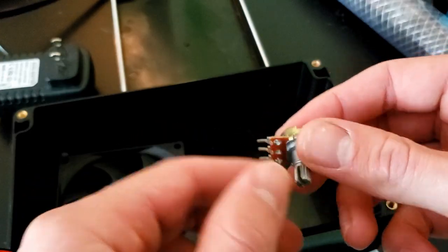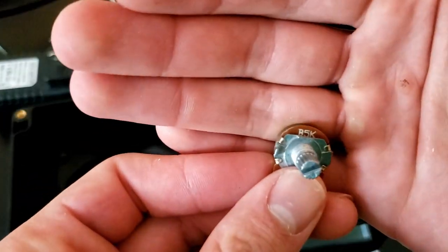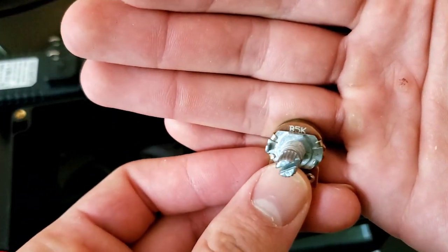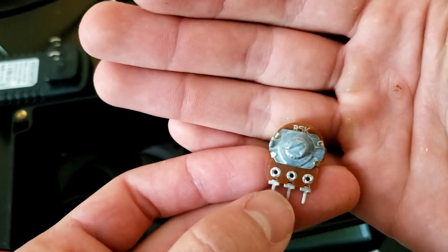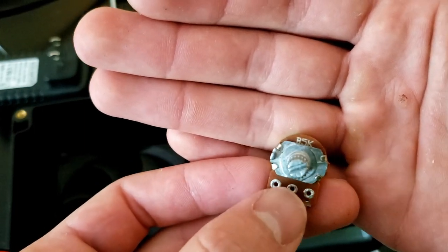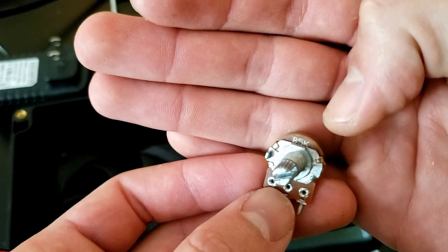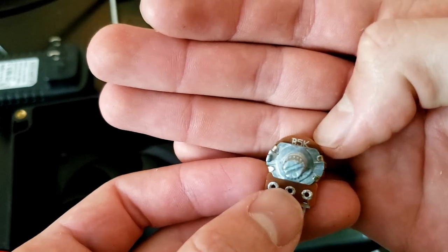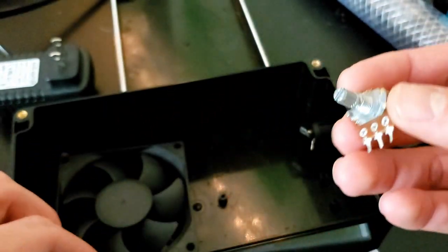This is a potentiometer. I'm using a 5 kilo-ohm potentiometer. I'm sure you can also use other ratings. I'm sure a 10 kilo-ohm would work fine. 20 probably as well.